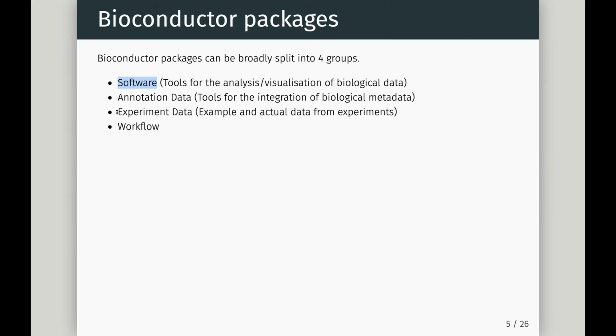And then what's really nice is they actually have experiment data as well. This isn't full experiment data, but they have data sets which are big enough to really encounter real world problems, running out of memory, taking time to actually process. They can put this inside what they call experiment data packages. So you can actually download the data from a particular publication, perhaps.